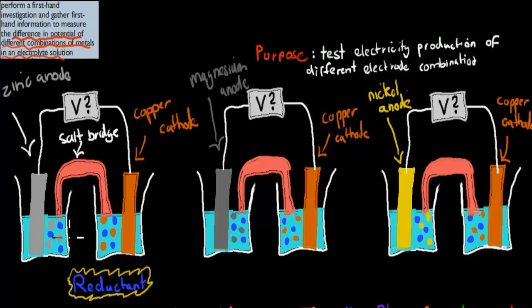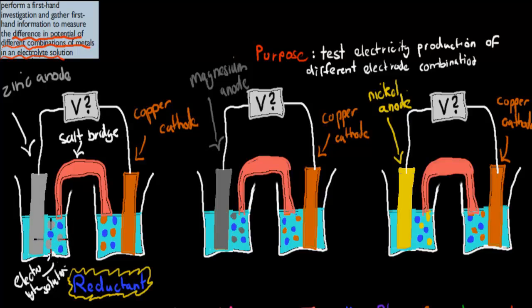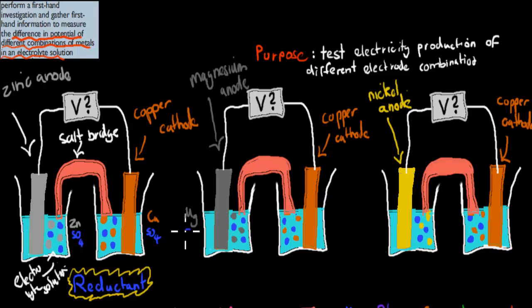We've got our salt bridge. We have our electrolyte solution. We've got Zinc Sulfate — it could be different types of solutions. In this beaker we have Copper Sulfate in the other beaker. This would be Magnesium Sulfate in the Magnesium half-cell. The colors correspond to the colors of these different ions — these are all ions. Again, this is Copper Sulfate, and then we have Nickel Sulfate.